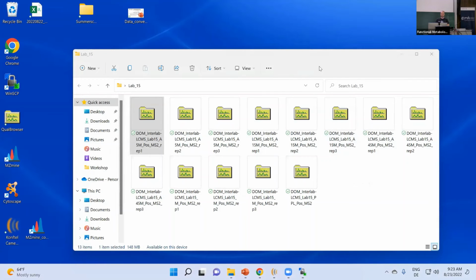But yeah, so let's say, okay, that is good. So now I want to convert these files to mzML format. But before I do so, there was a question. Yeah, sorry, the QCs. Do you mean you open all the QCs and look?